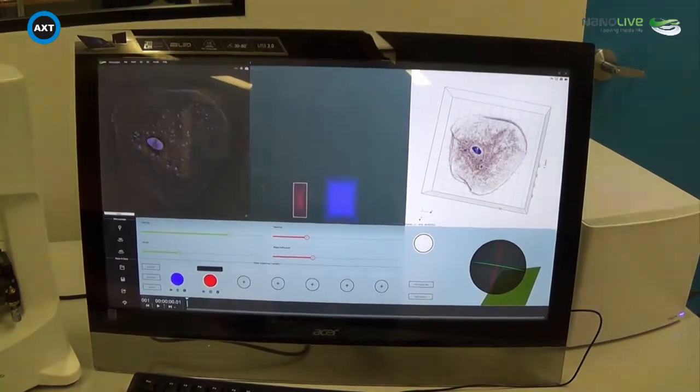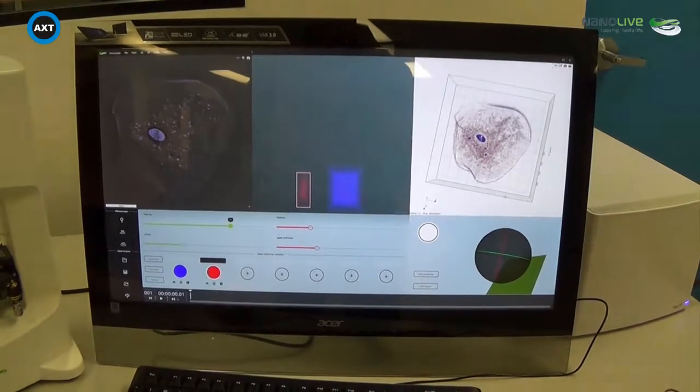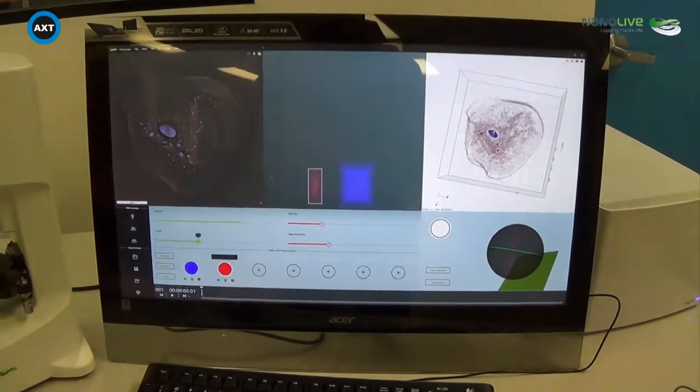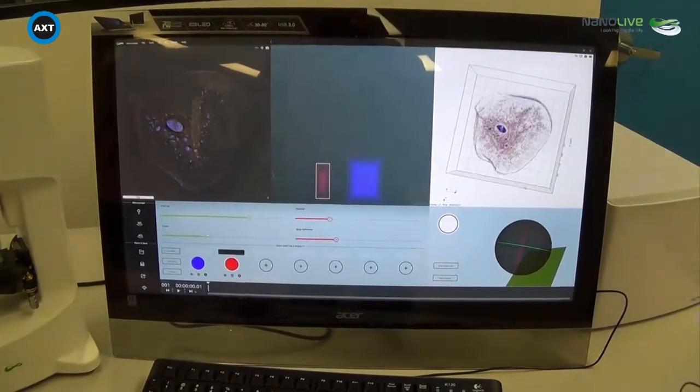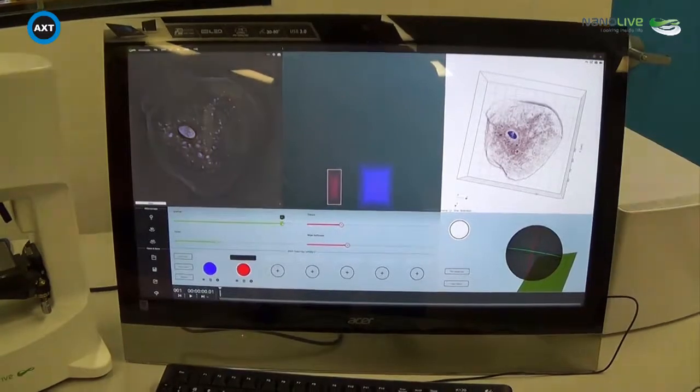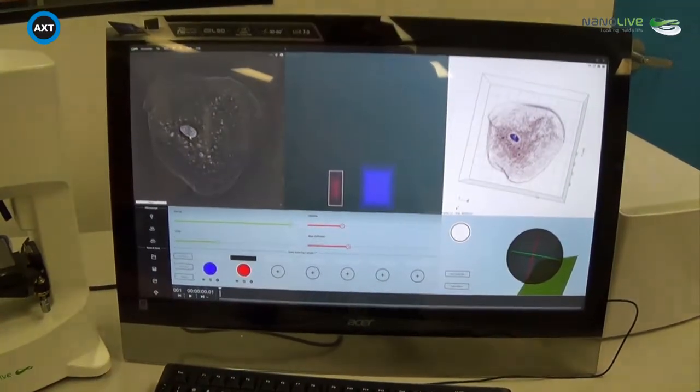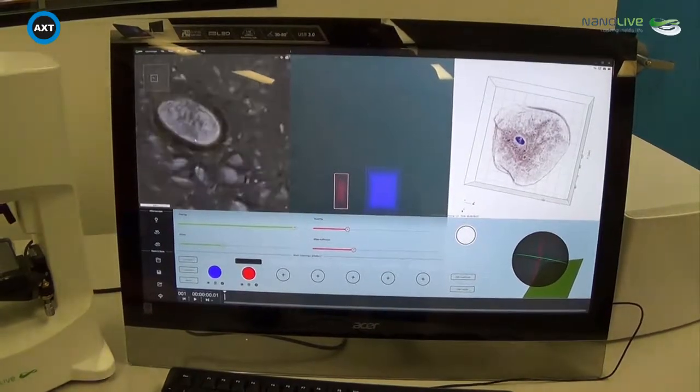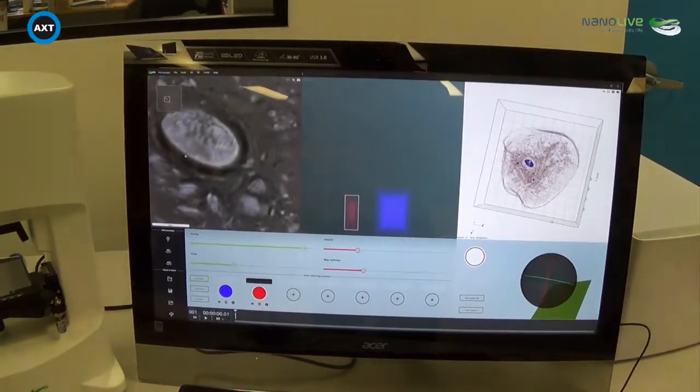And so the image is on the screen there. You can zoom in on any particular feature to get more detail. Yeah, that's right. So if we look at this 2D sliced view here, we find a spot that looks interesting, maybe just the nucleus in this case. We can hover at the point that we want to zoom in on and then just scroll with our mouse and look closer at the image at a zoomed point.